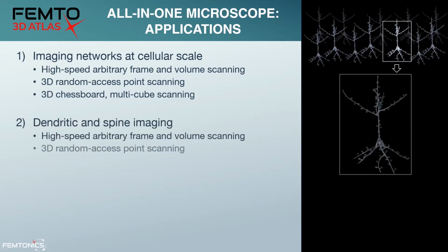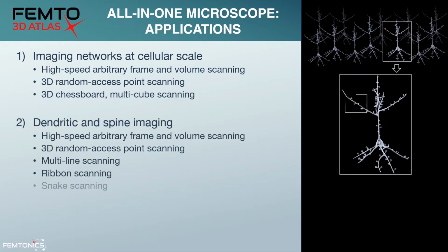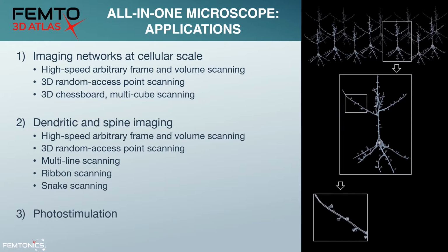In the second part, I demonstrate how a multitude of sub-micrometer sized compartments can be imaged with FEMTO3D Atlas. In the third part, I will show you how the system can be used for simultaneous photostimulation and imaging in 3D.